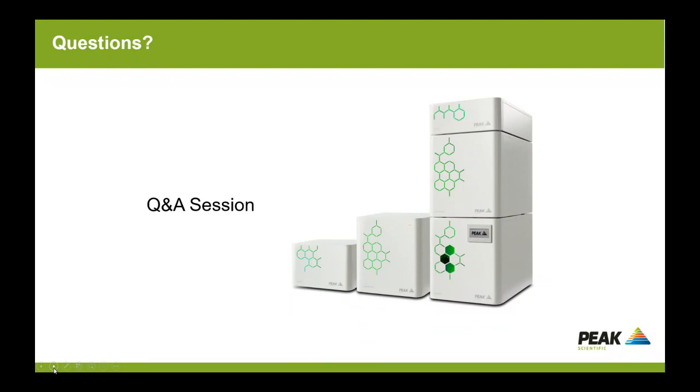All of the gas generators do require an electrical supply, of course. So if you are using a green supply of electricity, then again, this will improve the environmental friendliness of the gas generator. And the expected lifetime of a gas generator should be anywhere from 5 to 7 years plus. We do have customers who've had generators in their laboratories for 10 years plus. The main thing is to maintain them. If you're using a hydrogen generator, use good quality deionized water. And if you look after the generator, it should work for you for a number of years.